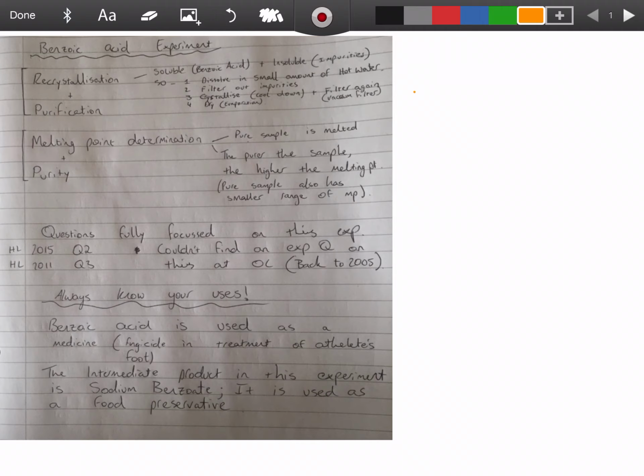It's usually split into two parts, as I've got here, 1 and 2. The actual making of the benzoic acid comes up quite rarely, if at all. It usually ties in the idea of recrystallization or the melting point determination, so they're the two bits I'm going to look at in most detail.